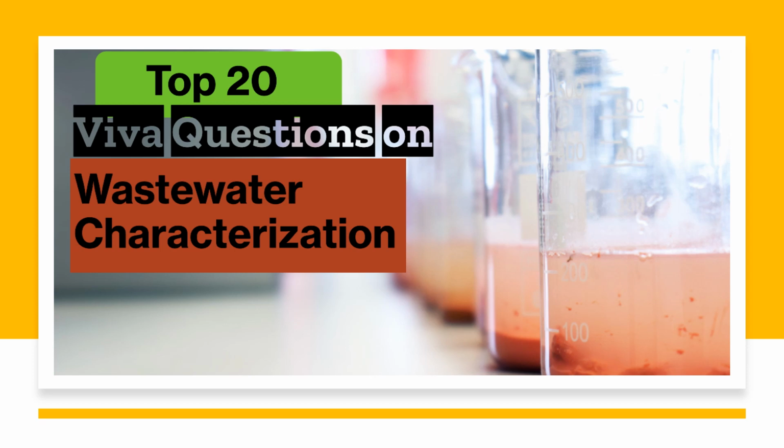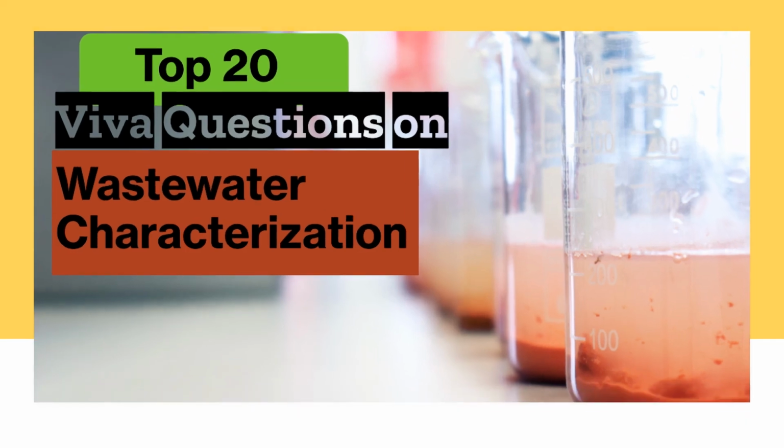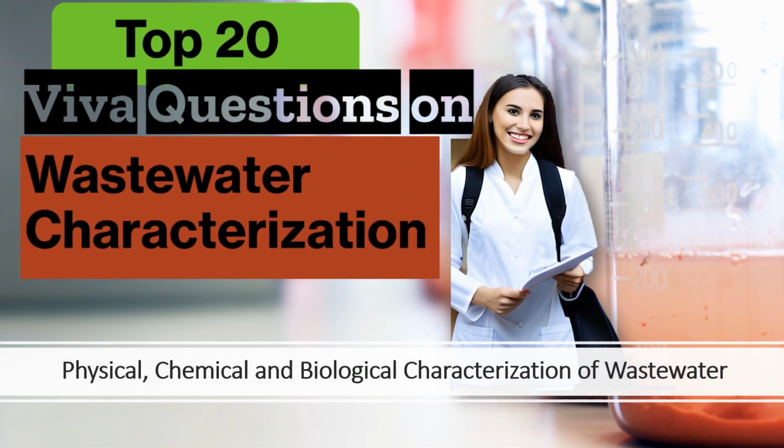Today we will be starting our new series on top 20 Viva questions which are frequently asked in the environmental engineering laboratories on various experiments. Our first in this series is the wastewater characterization, where we will be discussing physical, chemical and biological characterization of water.